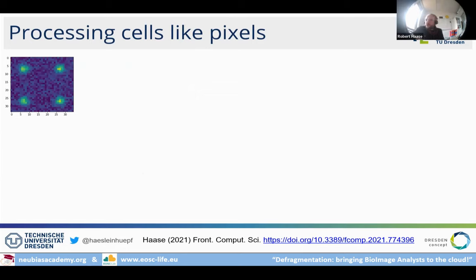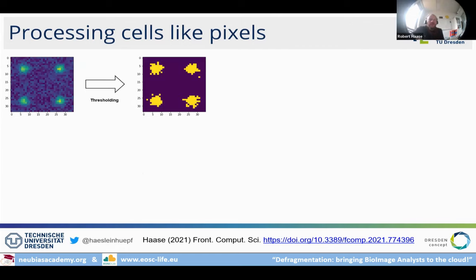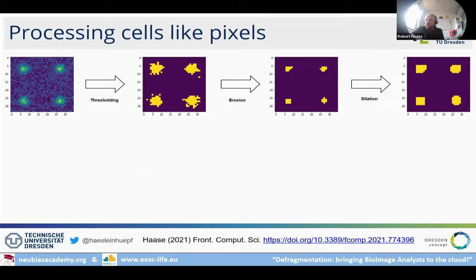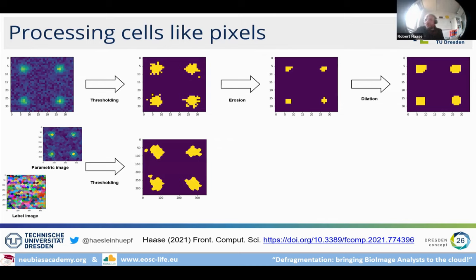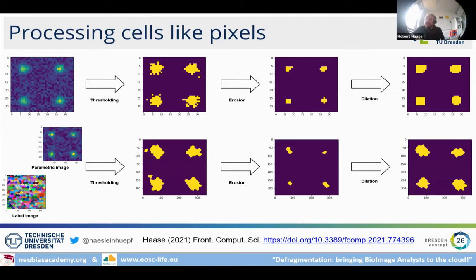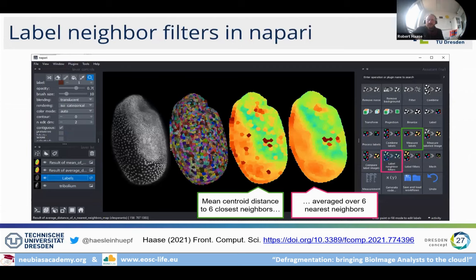As a practical example: we have an intensity image, do thresholding, erosion, dilation, and get a segmentation result — image processing 101. If we take a label image of cells and a corresponding parametric image — for example, gene expression or elongation of those cells — we can also threshold cells by expression value, getting a binary cell image, and apply erosion and dilation to them.